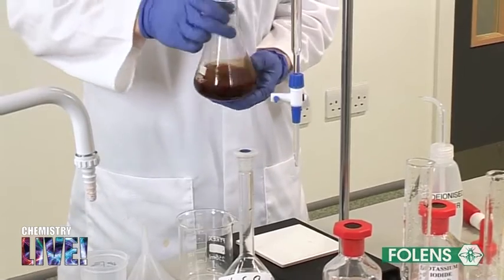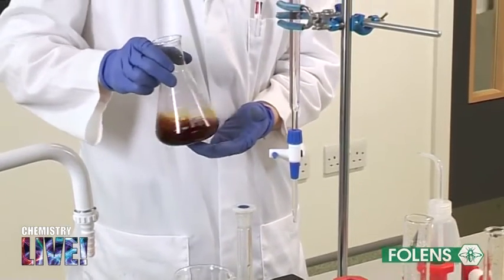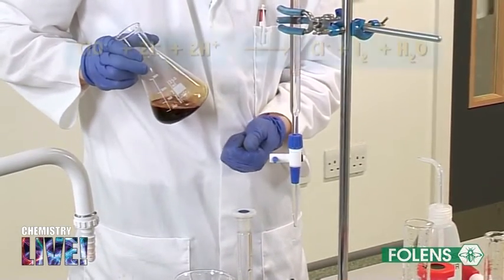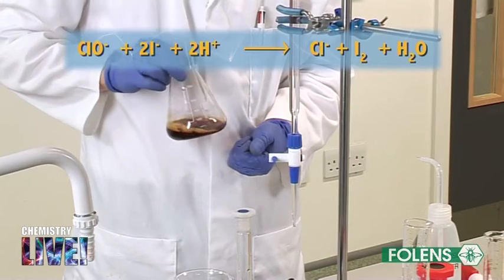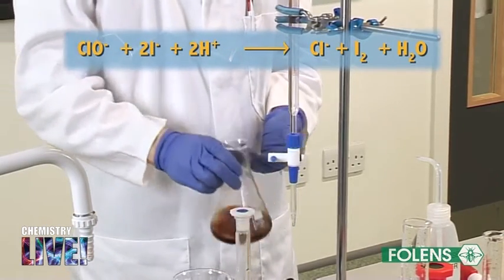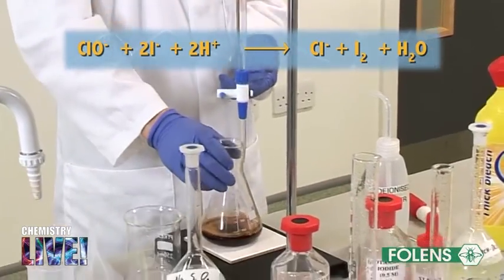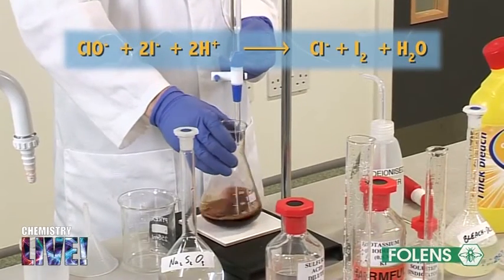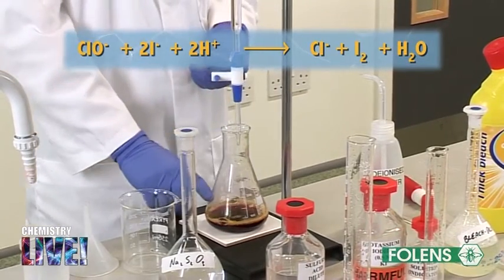Note the reddish-brown color of the iodine formed. The equation for this reaction is shown on the screen. The hypochlorite ion is like potassium permanganate in that it is an oxidizing agent and converts iodide ions to iodine.